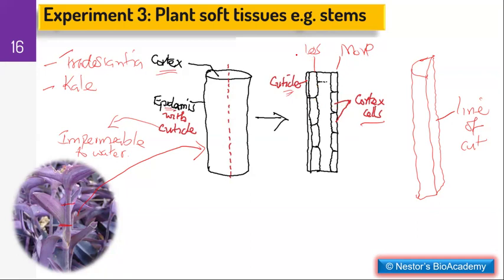So again, you can be asked to make a stem cutting, cut it into 2 halves longitudinally, and then place the 2 cut halves into different solutions. One solution will probably be hypertonic, the other one probably hypotonic, and possibly another one can be isotonic, or you can be told to leave one as a control, not placed in any of the solutions.